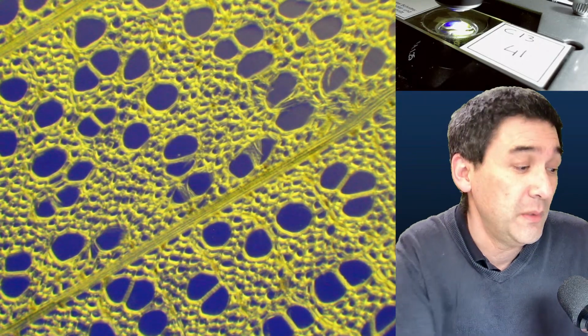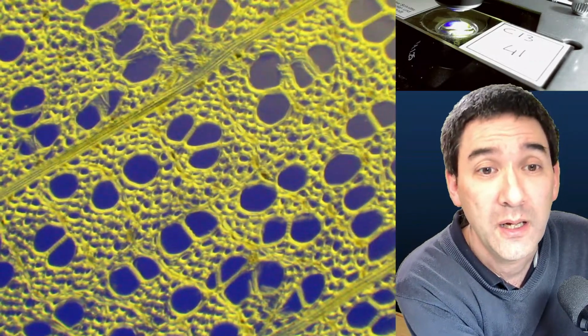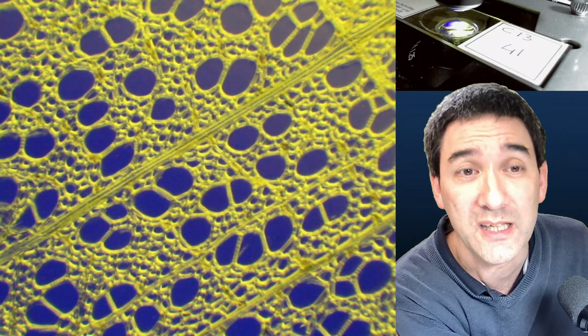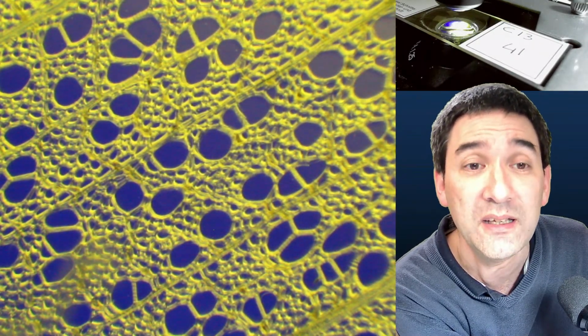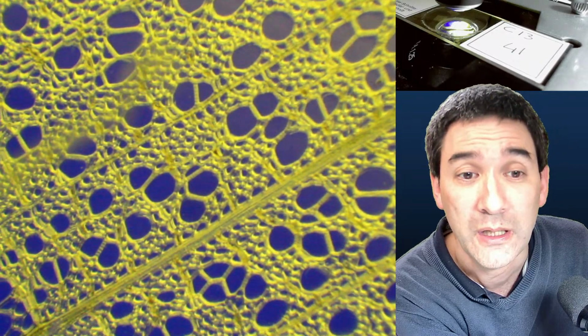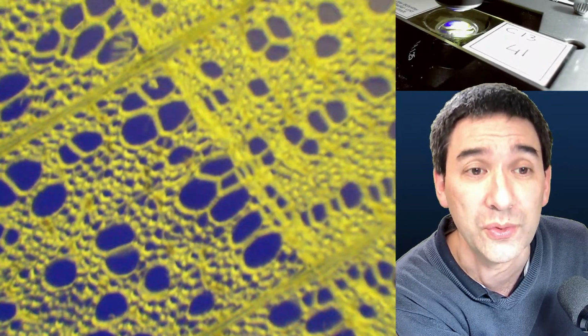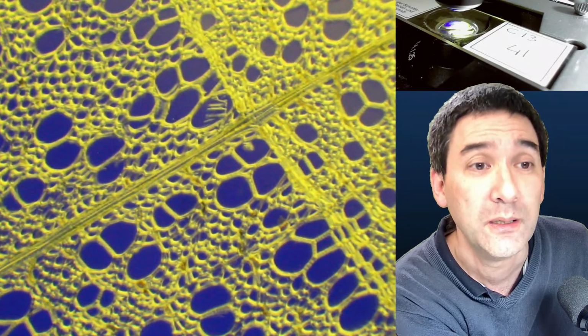Generally, the outer part of the wood is the living part. Another thing that's important to know here is that this is a prepared sample, so it has been cut, and anything that was in the cell has already been removed. But generally, if you take some wood and cut it yourself, you're also going to see those structures and those spaces, as you say.